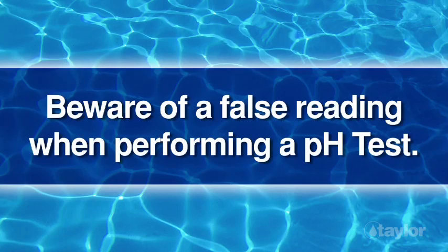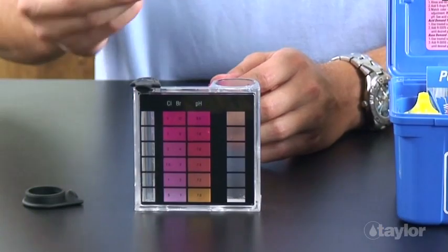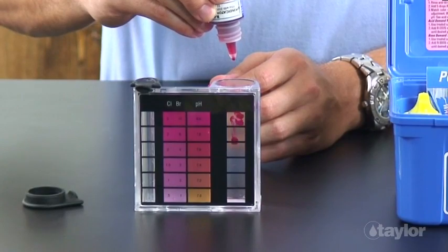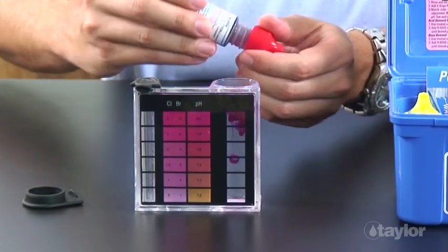Beware of a false reading when performing a pH test. Any of Taylor's phenol red indicators will give a false pH reading in the presence of a high level of halogen sanitizer.